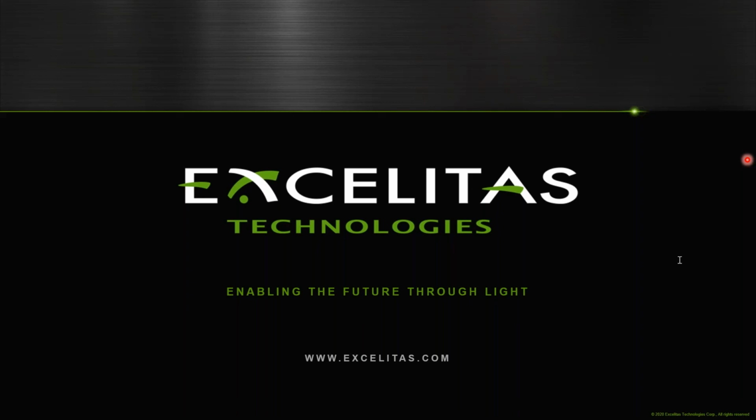You're speaking to biological applications. What about imaging of fluorescent materials like quantum dots on film, for example? Do LEDs have enough power, especially in the UV or blue range, for quantum dot excitation? So quantum dots takes me back like 15 years when they first came out, and I have not revisited it, except for in biological applications where lasers used to be used. I don't know the answer to that because I have not played with quantum dots in several years now. But from what I have seen over the years, I don't see an issue, because if lamps and lasers were able to excite quantum dots, I think our LEDs would be able to match them.